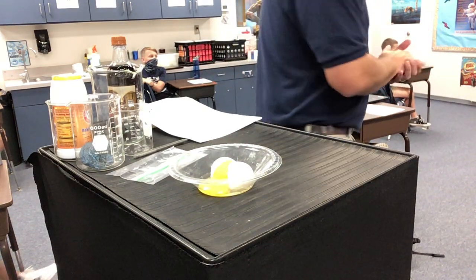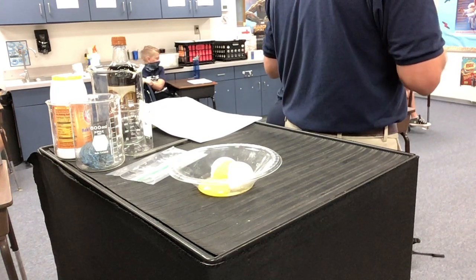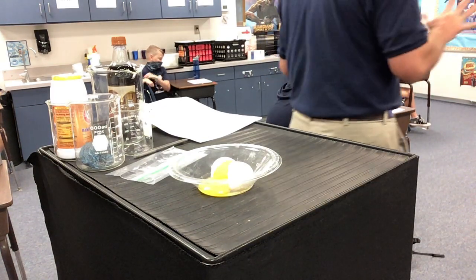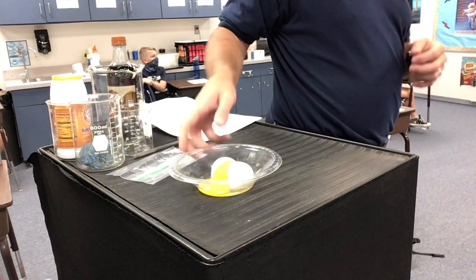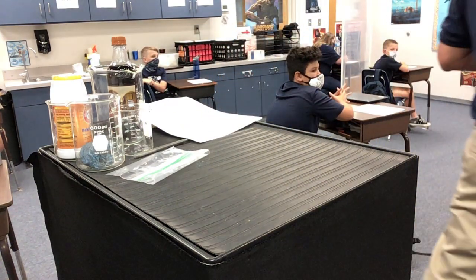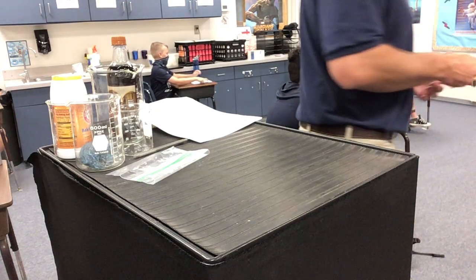Did it start bubbling? Do you see bubbles there? Is it foaming up? Is it making some kind of a gas? You guys just determine this on your own. Is there an odor? Let's see. Does it smell like anything other than egg? No, it doesn't smell like anything other than egg.